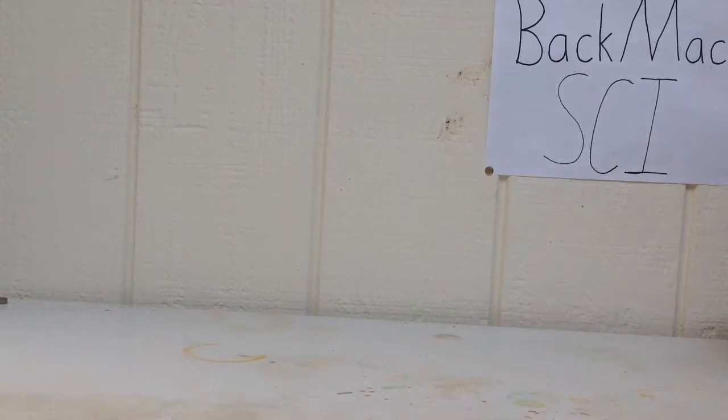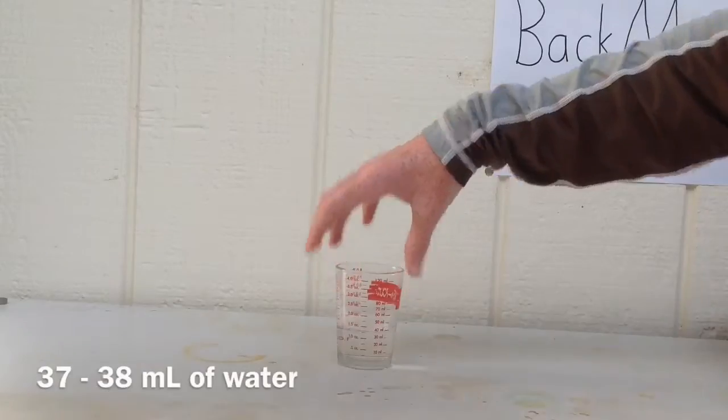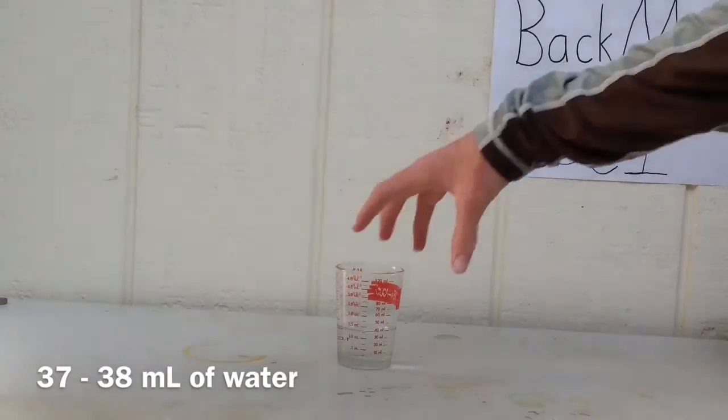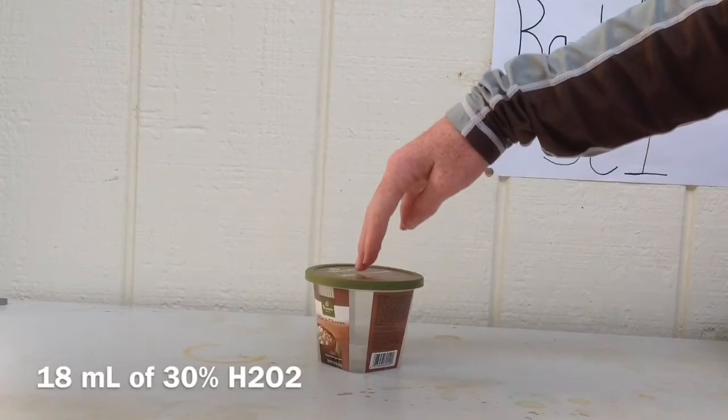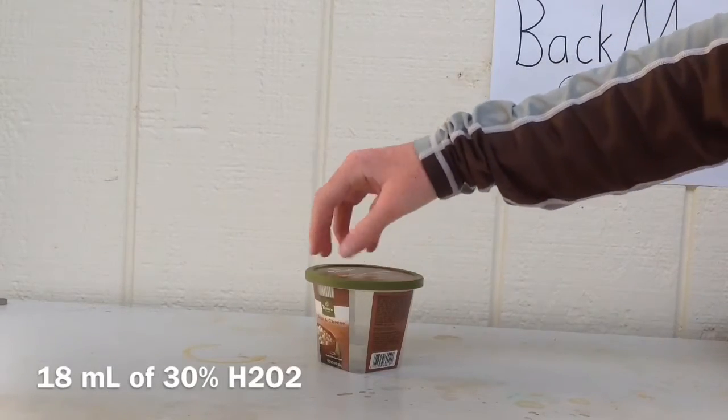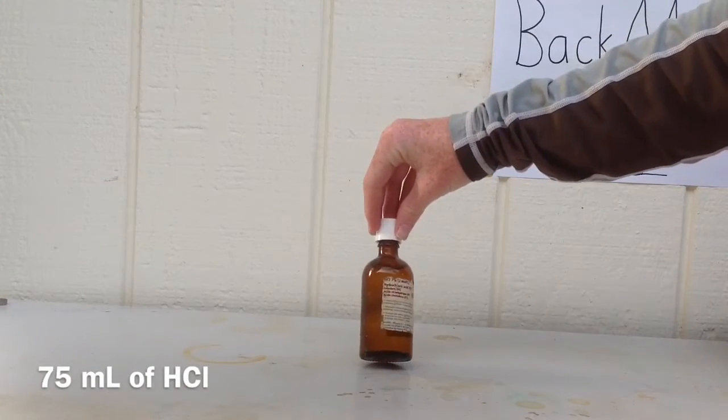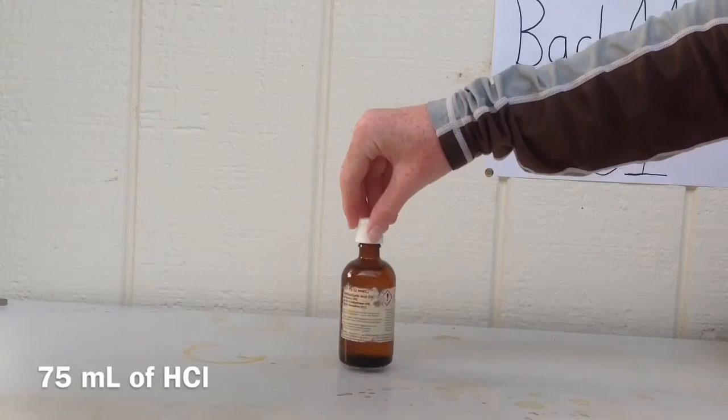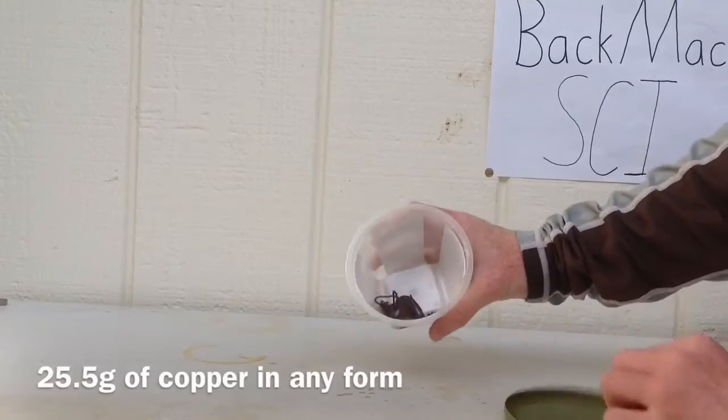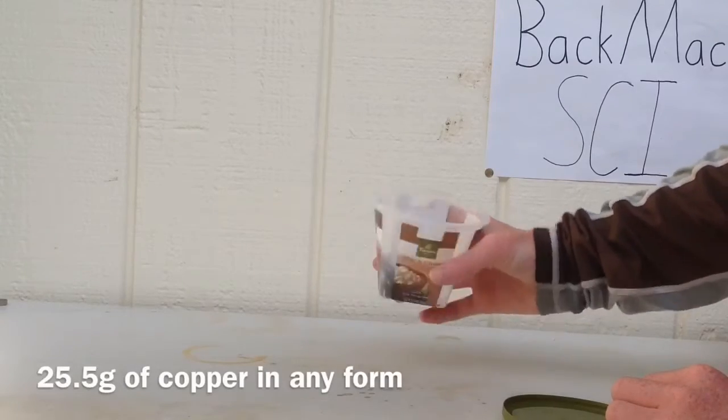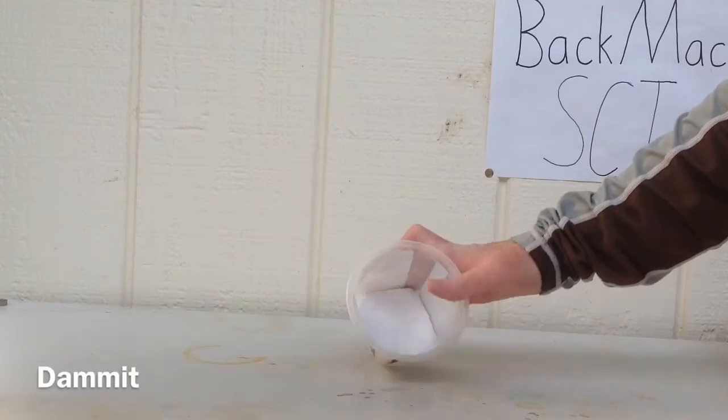What we're going to need today is a 250 milliliter flask, about 37 or 38 milliliters of water, 18 milliliters of 30% hydrogen peroxide, 75 milliliters of concentrated hydrochloric acid, 25.5 grams of copper, and 60 grams of a nitrate salt.